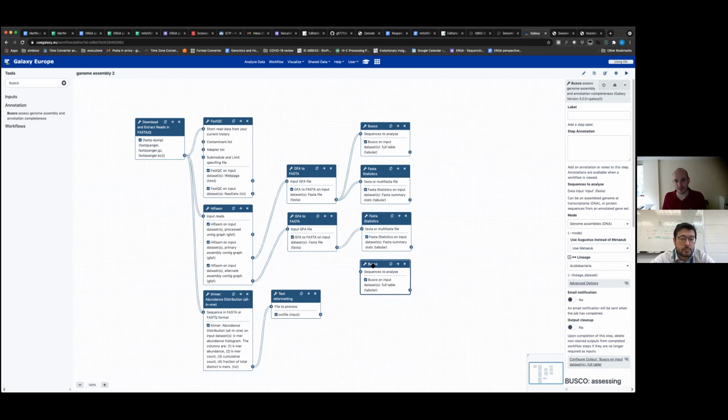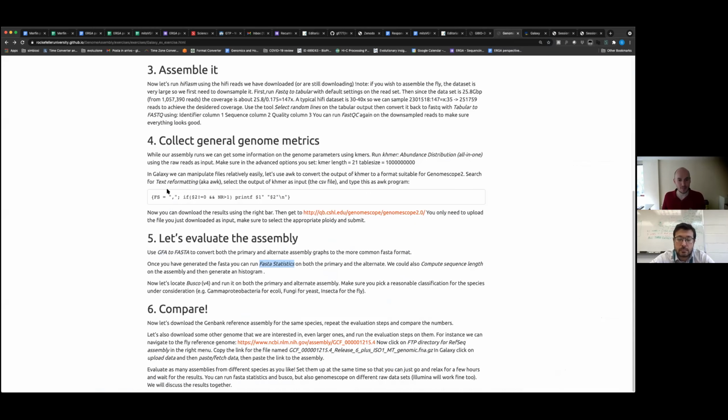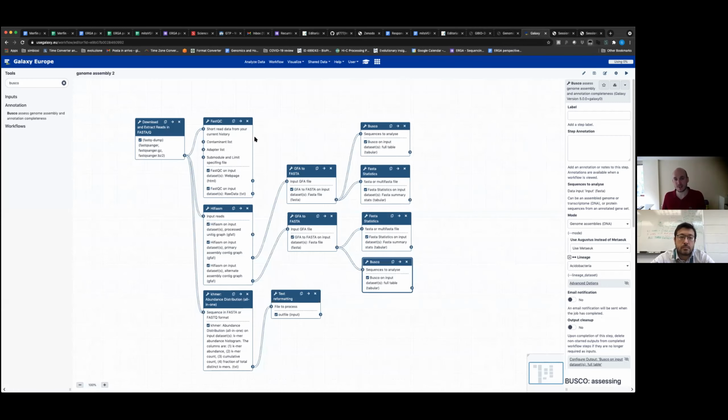So here. And you can see how, let's say, complicated, but also relatively easy to handle the pipeline can become using this kind of tools. I'm now going to run the compare step here, because that's probably something that one will do only at the very end, depending on the results. But yes, this is pretty much it.